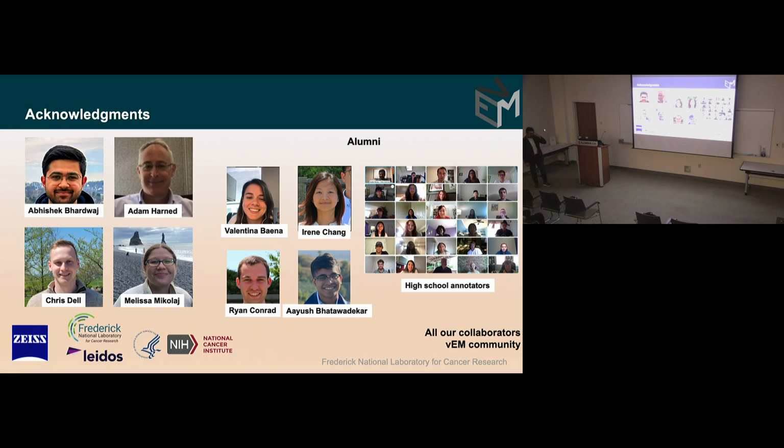One mistake that we made when we released Empanada is we forgot to ask people to give their own models. Let's say somebody is interested in nuclei and has created a model. We didn't put a mechanism by which they could deposit those model weights back onto the Empanada website, which in retrospect was a big problem, because somebody probably has a nuclear model that works just fine. It's just that we don't know about it.